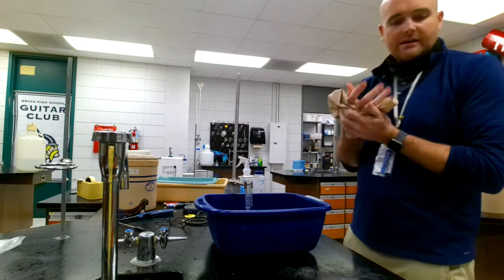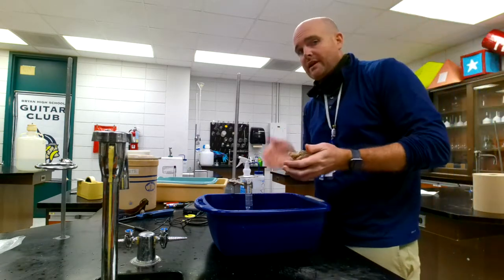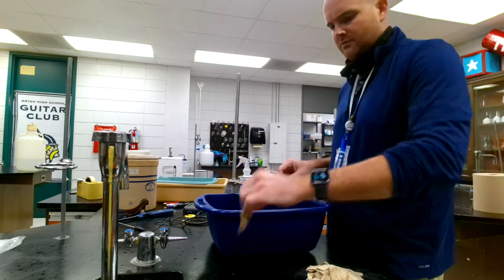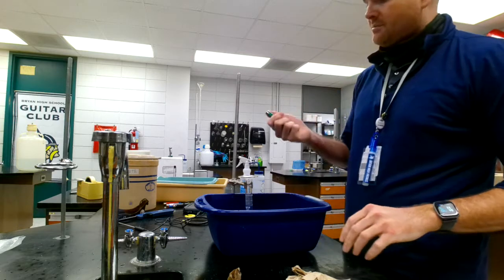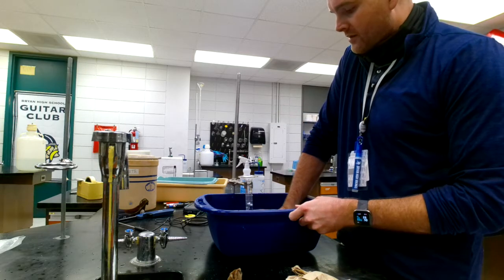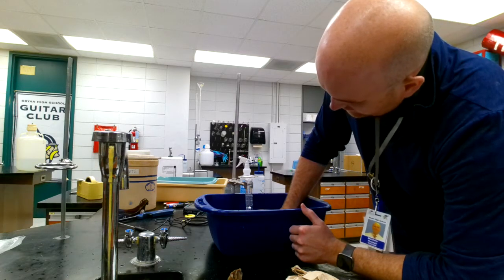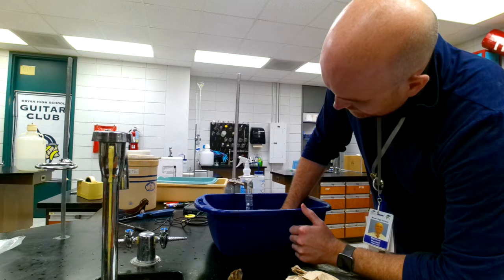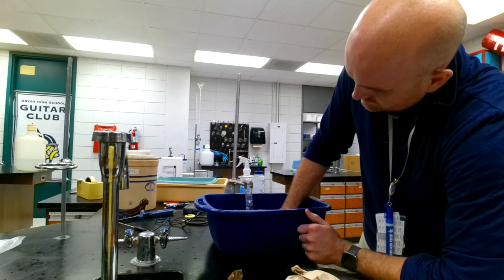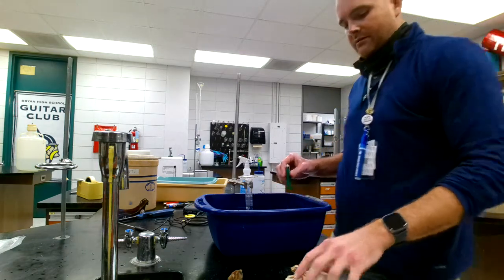So I'm going to take that lighter, and now there is no gas in the column, right? Now we're going to add some gas, and we're going to let the gas come out underneath here, and you can see it's bubbling out pretty well. We're going to let it go until it's about halfway. Okay, it should be enough.